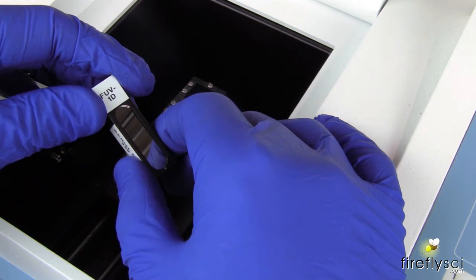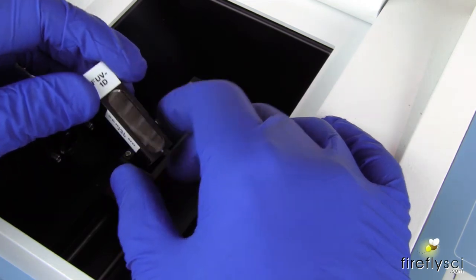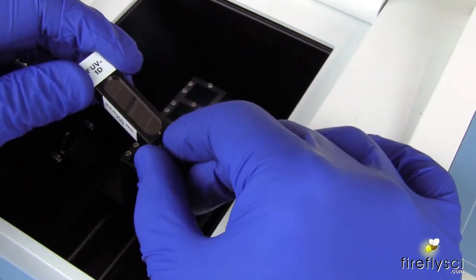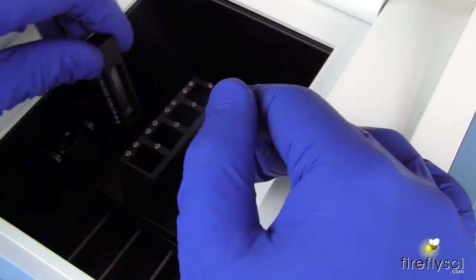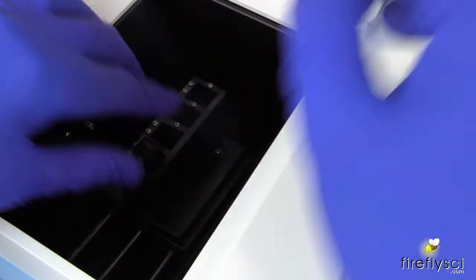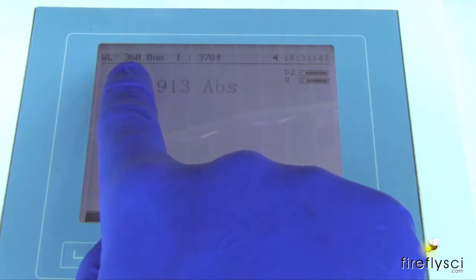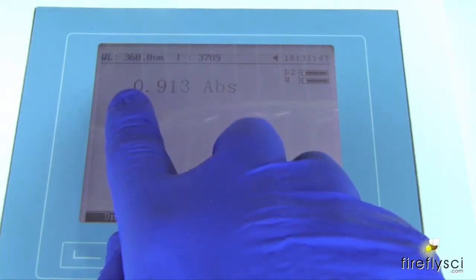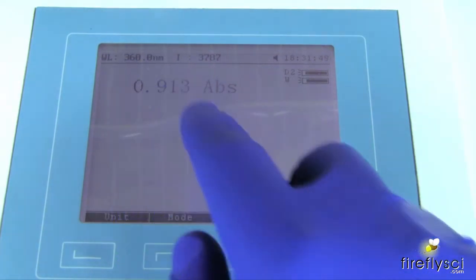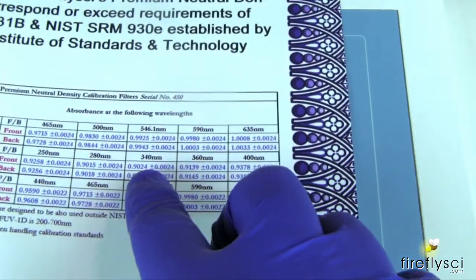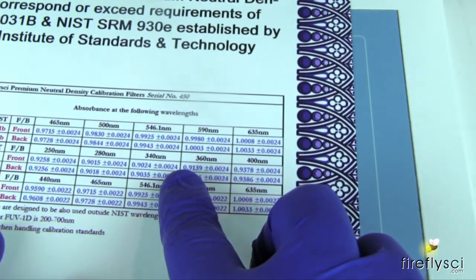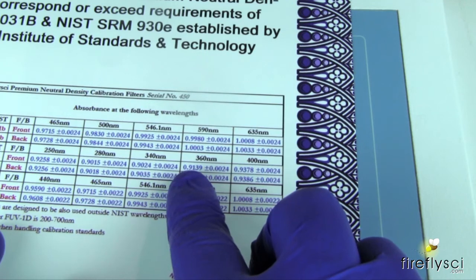Now I'm just going to insert the FUV-1D filter with the white dot here facing the light source of the spectrophotometer. And now we'll compare the reading on the spectrophotometer to the certificate of calibration. So again, we're looking at 360 nanometers and our machine showing a reading of 0.913. And we're doing the front scan right now, so here we go, 0.913 is perfect.